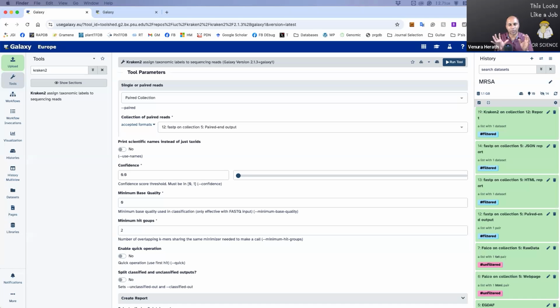We are looking at the whole population, and based on the reads we can identify multiple species. To give you an example, I was working with potato genomes, and there I used the Kraken tool to identify whatever other viruses were present in that same sample.